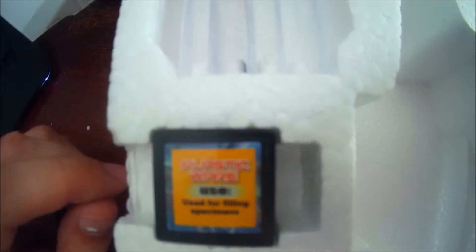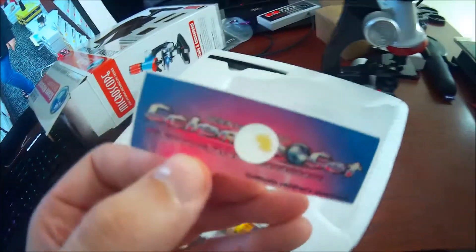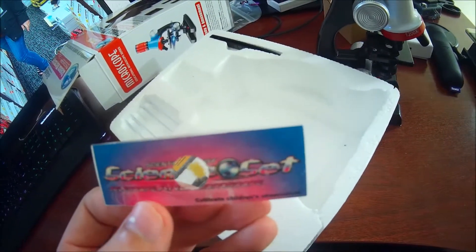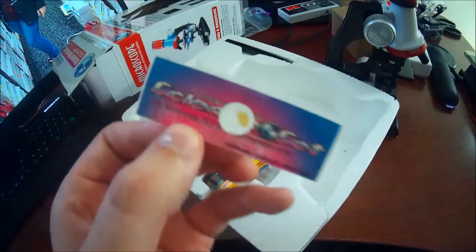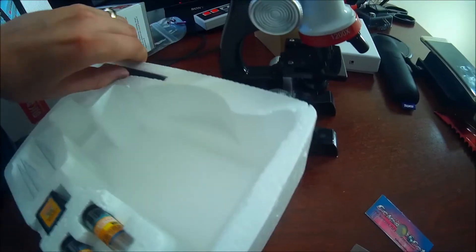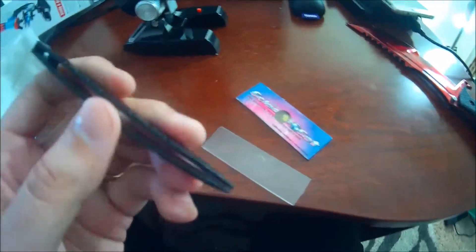And what else we got? We got plastic ware used for filling specimens. We got a collection bottle and another collection bottle. And what is this? Wow, these already got specimens in them. This is the Science Set Cultivate Children's Observation. I don't know what's in this one, but they already got a specimen for us, which is cool. And here you can fill your own specimens. So exciting — we're actually going to do that. We got a tweezer right here and we're going to put something cool in there and have a look. So get ready.